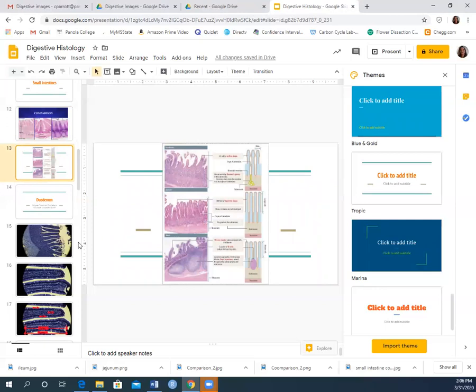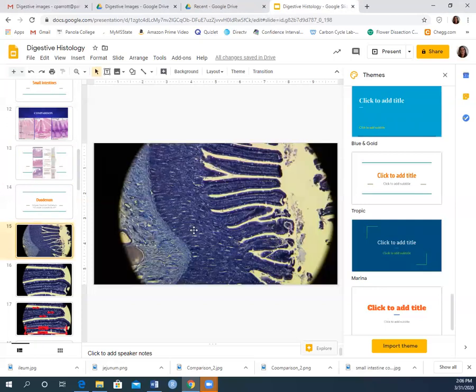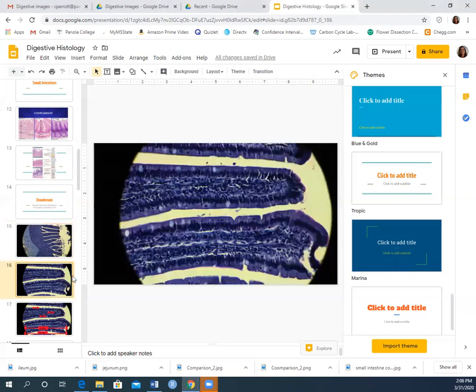Okay. So here are some pictures of duodenum, and you can see that you have some of these that are flaked off. Here's another piece that's flaked off. This whole entire piece is flaked off, and then you see bits and pieces up here. Okay, that's what I was talking about, how you have almost like the dried leaf pieces that are flaking off.